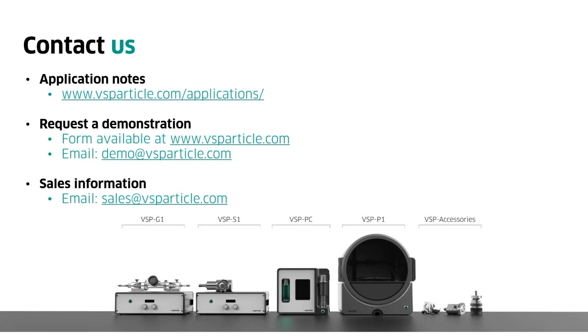That depends a bit. What I tried to highlight is that these hollow tubes have as an advantage that your gas exhaust is this tiny little tube coming out instead of this bigger reactor volume, right? So it's a massive change in volume. You go from 100s of cc's down to a couple of cc's, and so with the same flow rate, you have a much faster displacement to get these particles out. And so if you want to get the tiniest particles, let's say a few atoms in size, go in a flow-through configuration because you can get the spark so much closer to your measurement device.